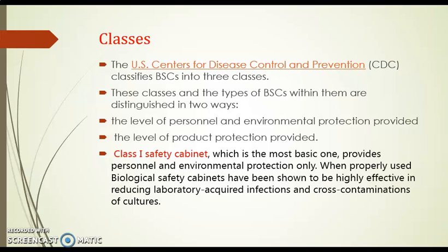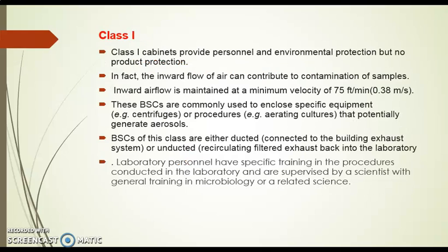When properly used, biological safety cabinets have been shown to be highly effective in reducing laboratory acquired infections and the cross contaminations of the cultures. So 3 classes are present. First, we can discuss the Class 1 Biological Safety Cabinet.